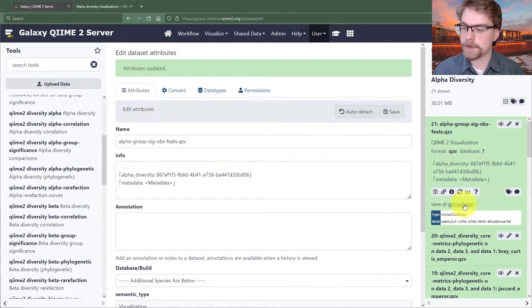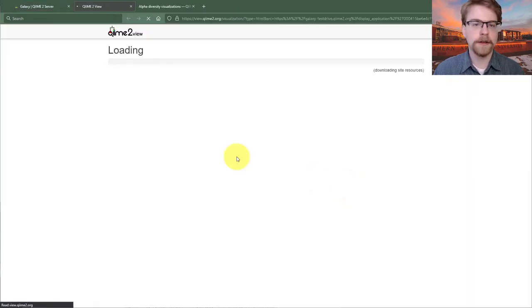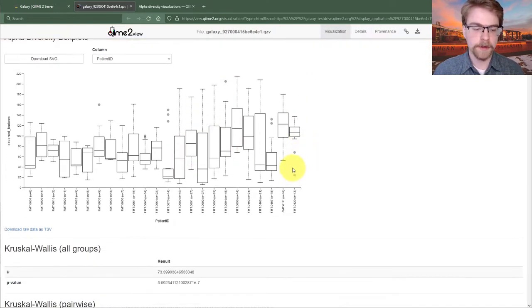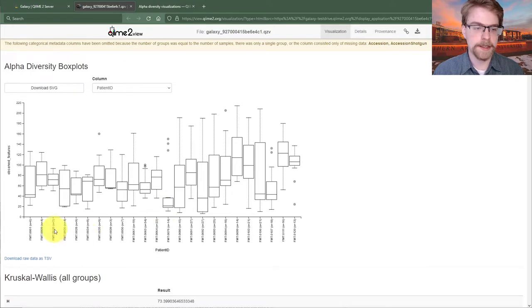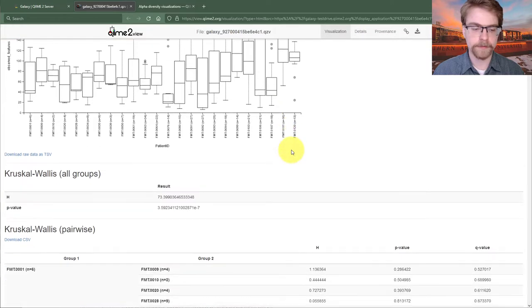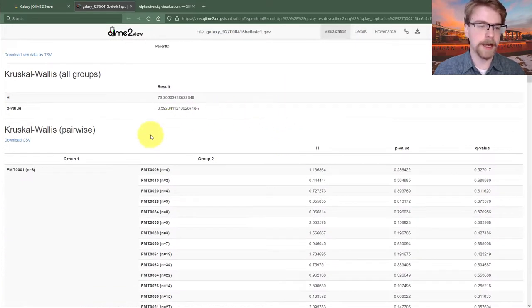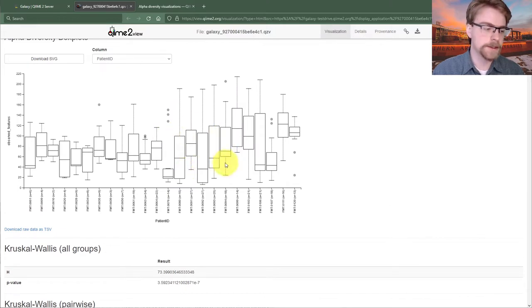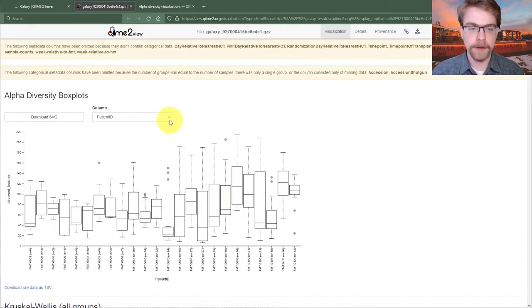To view the results, I'll click the view button and we see some box plots. The first is patient ID — these are the patients of the study. Observed features, or richness, is actually quite different between them. Looking at the p-value, it is unbelievably significant, which is not surprising because these are different individuals and they all have different microbiomes.